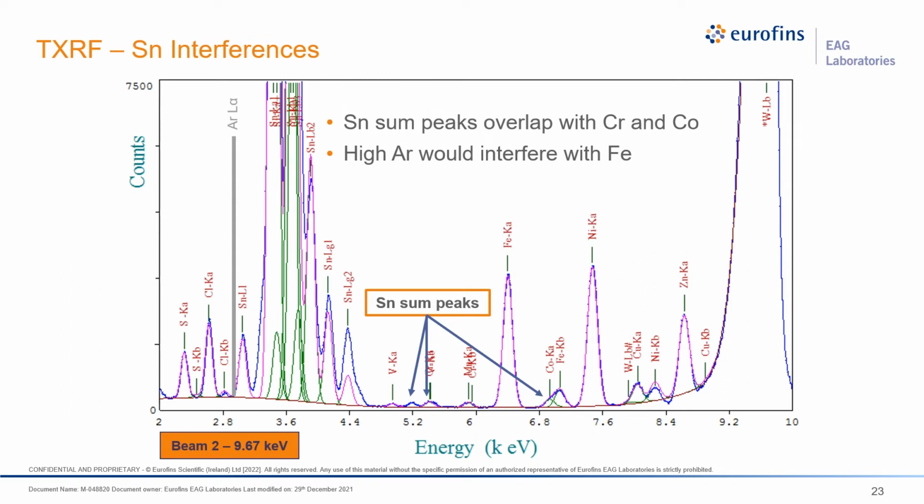So I just wanted to show here that interferences happen. We can overcome some of them. Some of them we can spot that aren't typically characterized. But if you have an interesting sample like this, just ask us beforehand and we can give you some advice on if it's going to work, if this is the best technique or not.